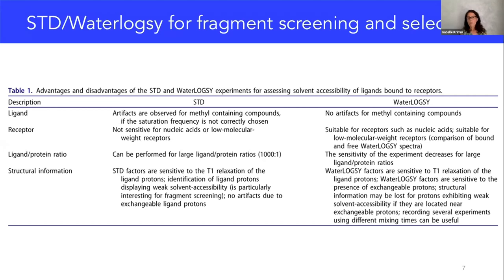Both experiments are of course sensitive to the T1 relaxation of the ligand protons. And you have to be careful with that to avoid artifacts when you use your data and compare the ligand STD intensities. And of course, as I said, you have to be careful when you have exchangeable protons. And the best is to use different mixing times so that you can see the influence of the mixing time on your data.